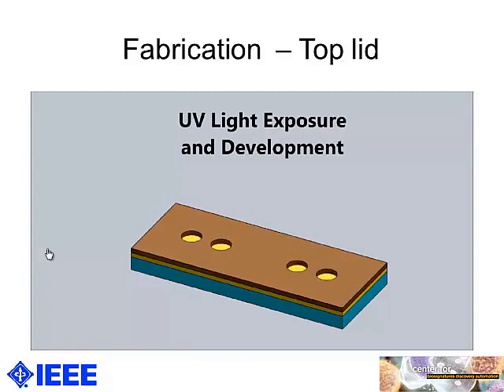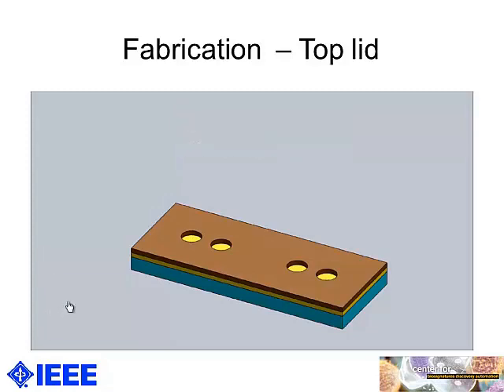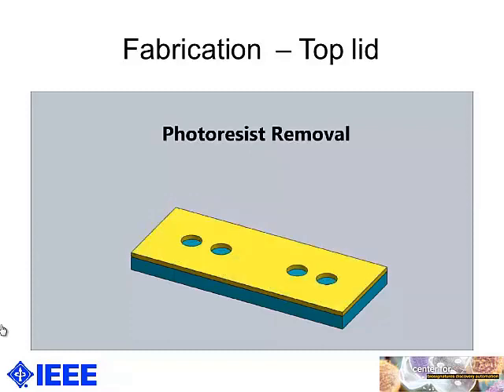And then by the help of the dry etch, we'll transfer the patterns from the photoresist to the amorphous silicon. And if we remove the photoresist, we'll see the amorphous silicon will serve as a hard mask.